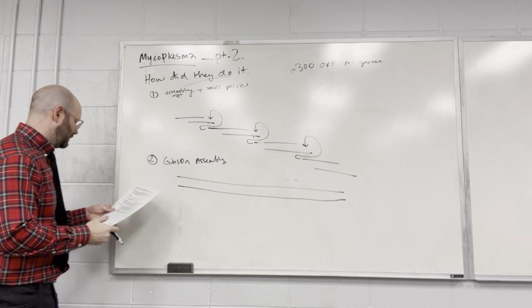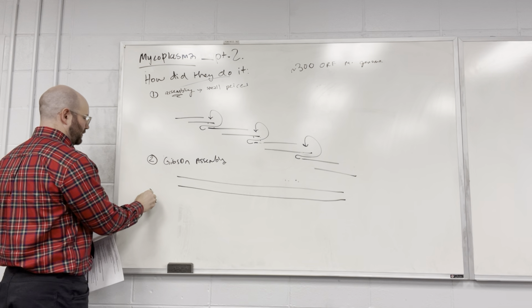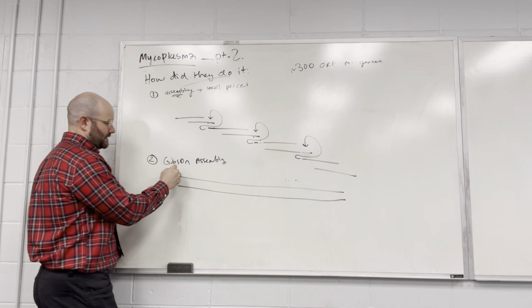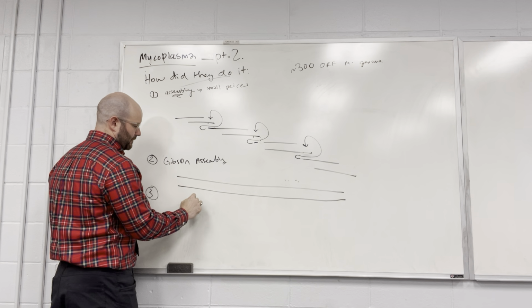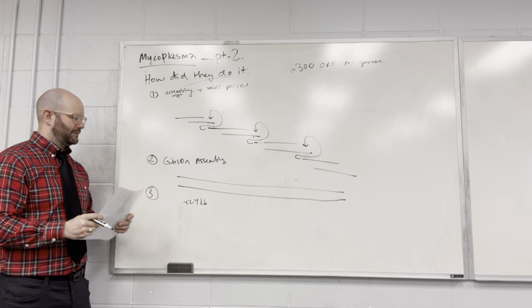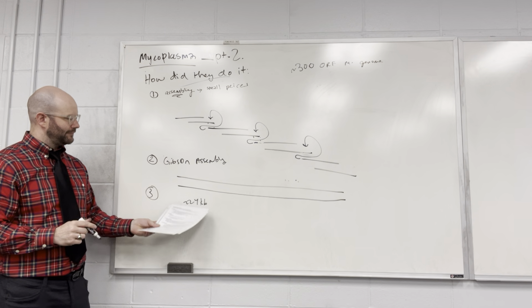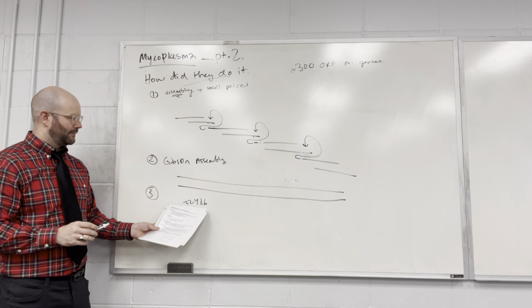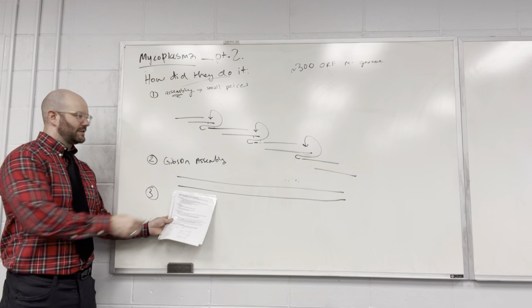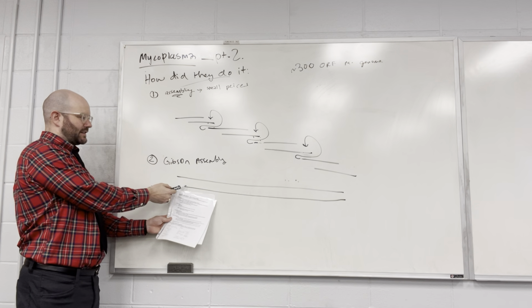And then what happens? What's the next thing that happens? Now the length of this thing is about 24 kb. What do they do with this thing? They take 3 of those 24 kbs and put them into. Wait, so first, this is just a linear piece of DNA, this thing that they just assembled. Is that stable?